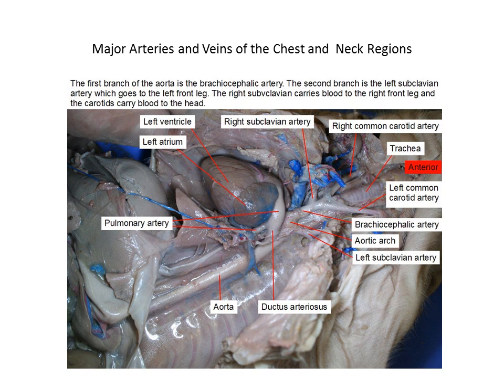I may have mentioned before, please don't get the aorta wrong. It's huge, but I will admit that it's a little bit tricky looking at that and trying to separate it from, say, the esophagus. There's a lot of grayish tubes running around back here. So if you have a question, please ask in the course of the meeting.